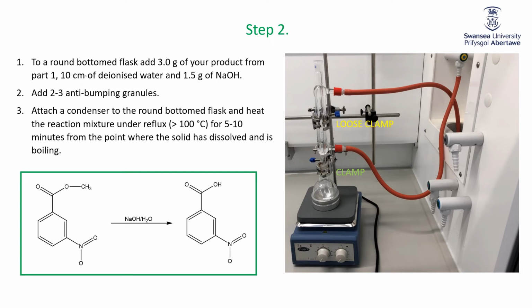Now the idea of doing a reflux, which is what you're doing, is you're able to do the reaction at the boiling point of the solvent. If we just had a beaker on the bench and we heated it up till the solvent boiled, the solvent would evaporate and our reaction mixture would boil dry. With the reflux though, you heat it up, the solution boils, the solvent evaporates, comes into the condenser, condenses, drips back down again, so that you can continue to do the reaction at the boiling point of the solvent. So in other words, hot, so therefore a fast reaction without any issues.